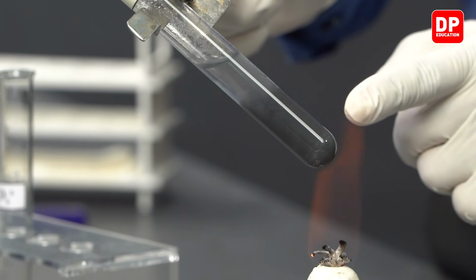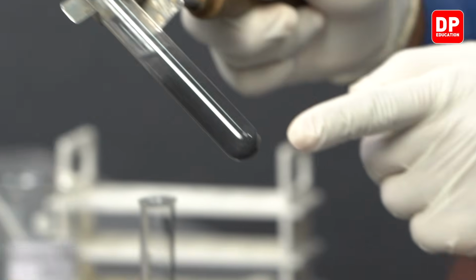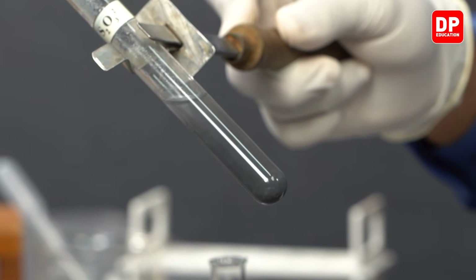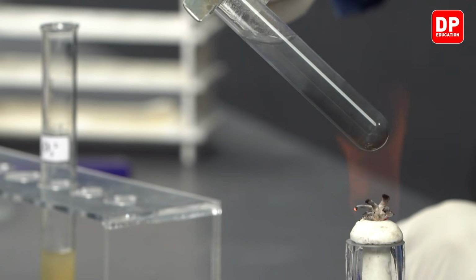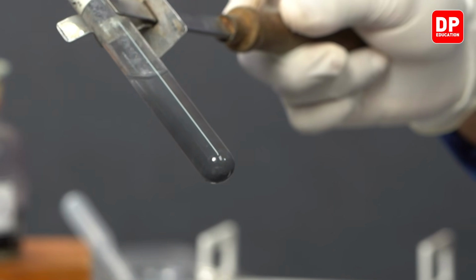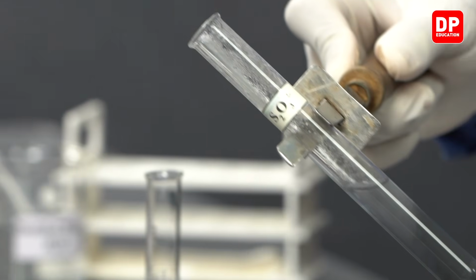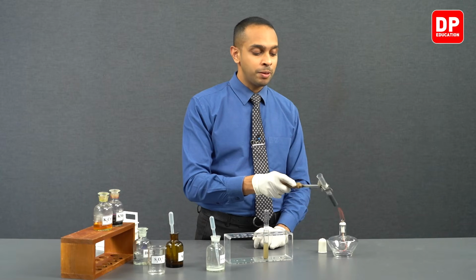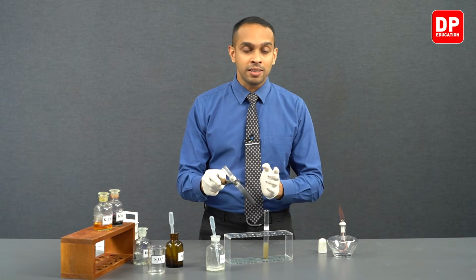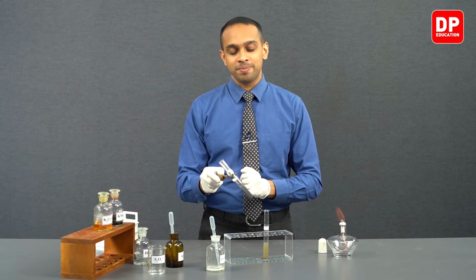You can see as the solution is starting to boil, the black color precipitate will get suspended in the aqueous medium a bit more, and you can observe the color of the precipitate very clearly. And what we have formed here is a black color precipitate, which is lead sulfide, and we formed it by heating our lead thiosulfate white color precipitate.